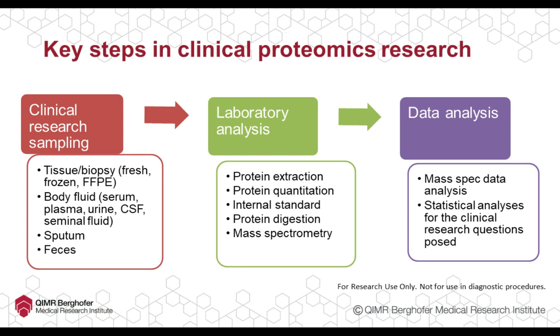This usually includes first the mass spec raw data conversion to protein identification and quantification. We'll consider that in the next section. And finally, there will be the statistical analysis of the quantitative proteomics data for the clinical research questions that were asked for the entire process.